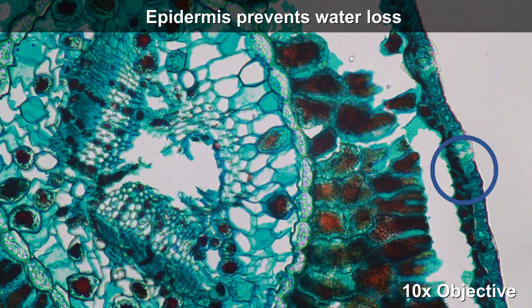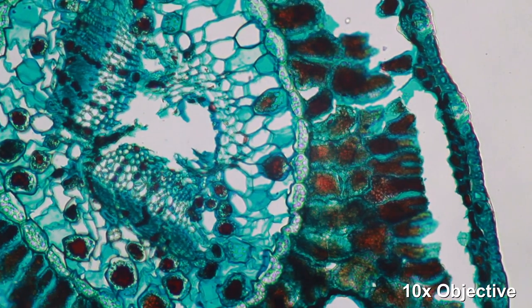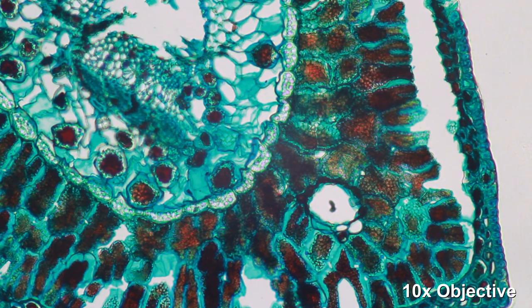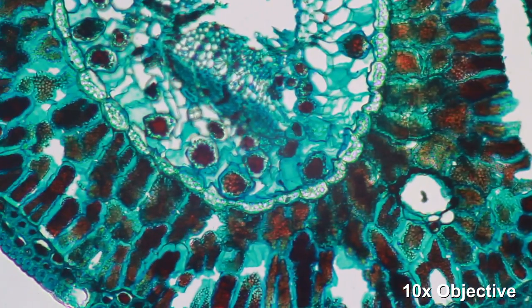Here on the right side, this is the epidermis—the outermost cell layer which protects the pine leaf from too much water loss.